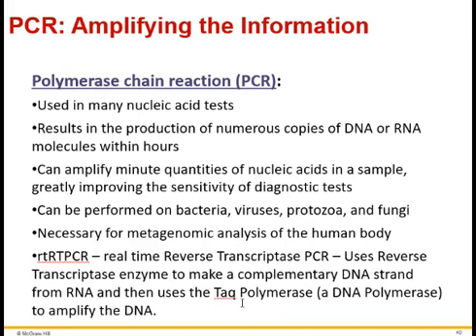And so it's adapted perfectly to go between these 94 degrees down to 72, down to 57 or whatever. There are three different temperatures that it has to work perfectly at, and this particular polymerase does that. But that amplifies the DNA. And basically, what the real-time part means is that when you get enough copies present, a fluorescent label is detected and you get a positive result.